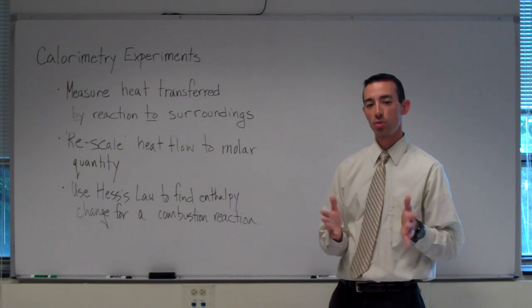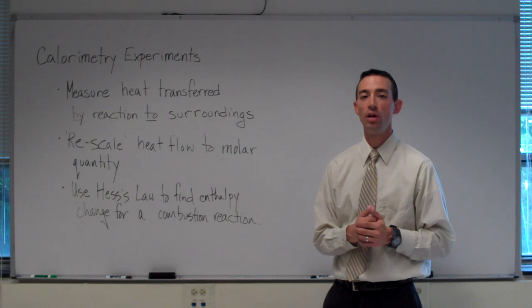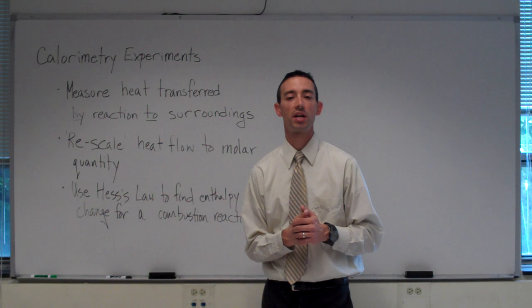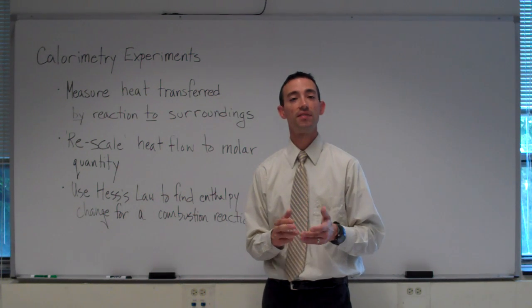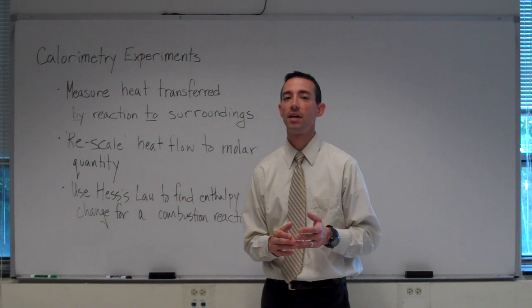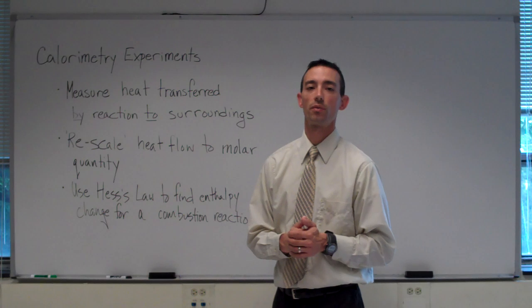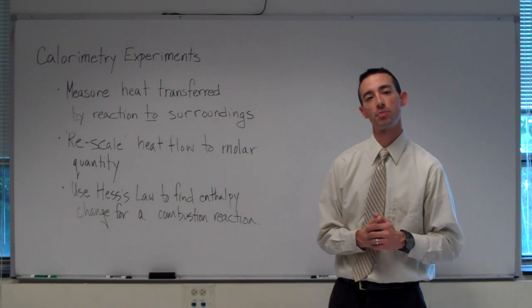Each week there should be a video prepared that would allow me to introduce to you the concepts and goals of the experiment that we'll be conducting in lab each week, and then to address some of the safety concerns as well as issues with the pre-lab questions. So let's get started with the first experiment of the semester, calorimetry experiments.